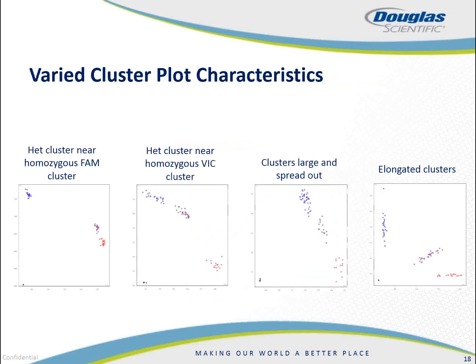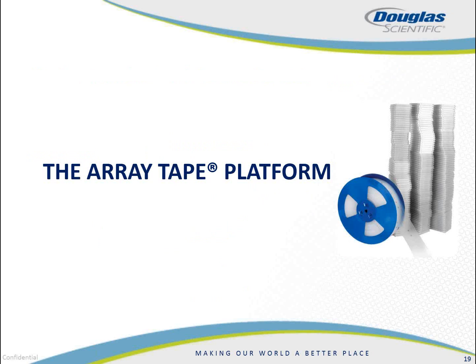So the one that I showed you before was what we want all of our clusters to look like, but in reality we get cluster plots that are in kind of a fairly wide variety of shapes and sizes. Here we have some clusters that have the heterozygous cluster closer to the FAM side, and then sometimes the heterozygous clusters closer to the Vic side. Some of the clusters can be large and spread out, and sometimes they're a little bit more elongated. However, in each of these cases, the clusters themselves can be scored with confidence.